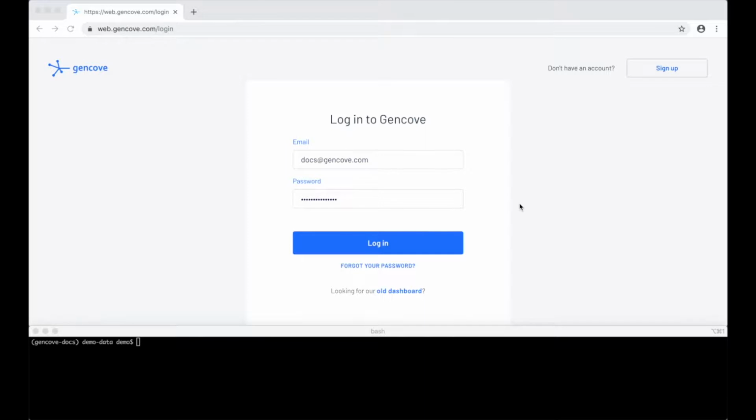We've also developed infrastructure to enable our customers to easily use these tools by our software as a service offering. We've gone a long way to make it easy to use by providing a web dashboard and command line interface, and enabling customers to directly integrate systems using our event-driven API.